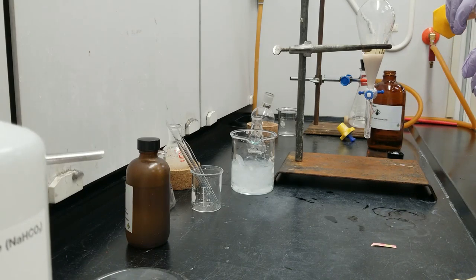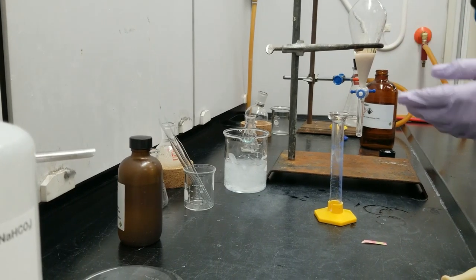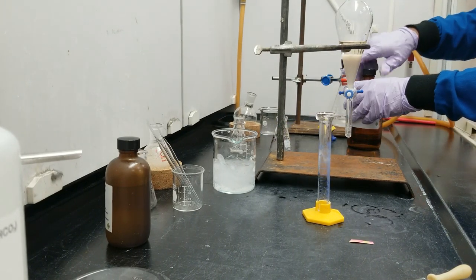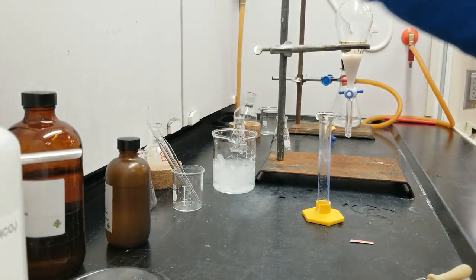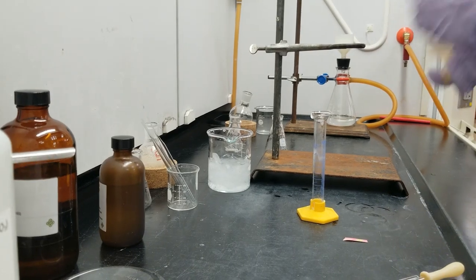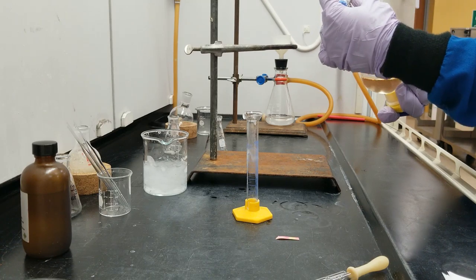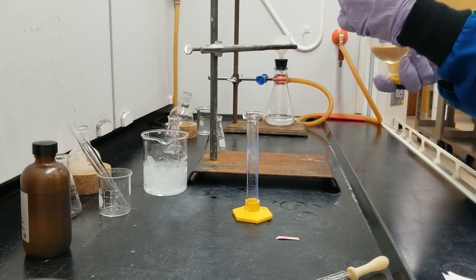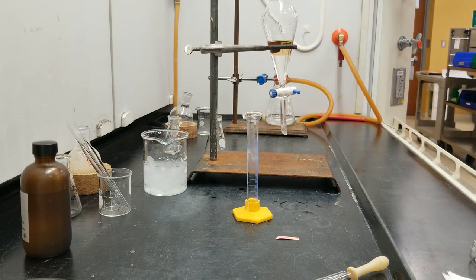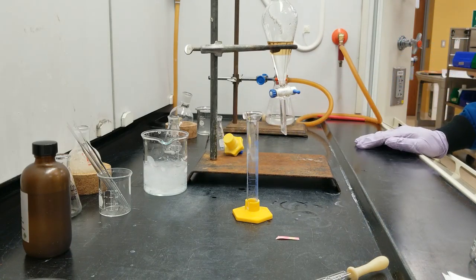I like to rinse this dye. That means I'm going to extract the aqueous layer. So cap it, flip it, shake, and vent. Shake, and vent. Do it three times. Keep it at rest. Now you can see there is no white solid, because all the solid that was in the aqueous layer came to the organic layer, because the solid is insoluble in water and soluble in the ether.